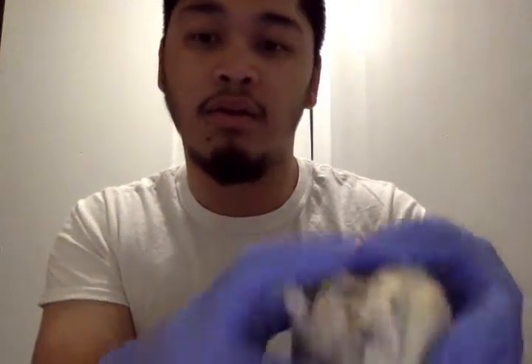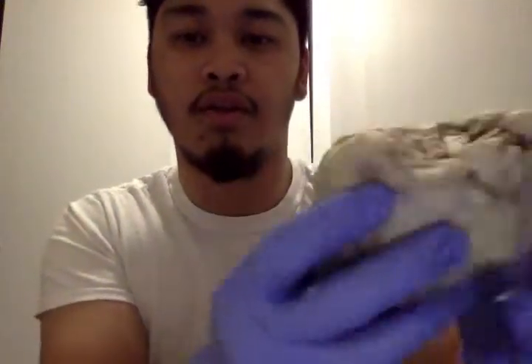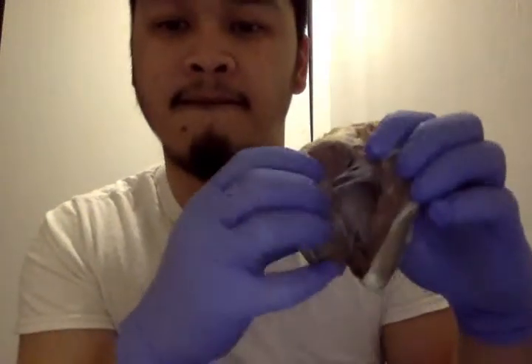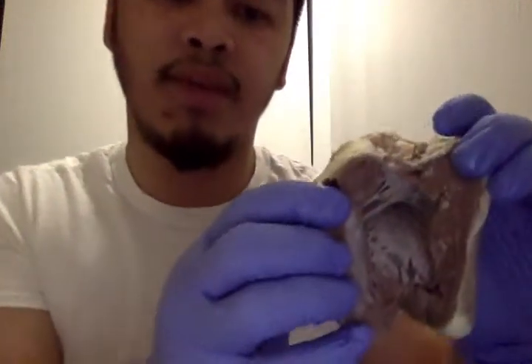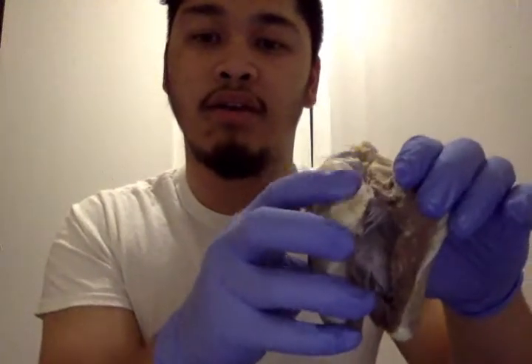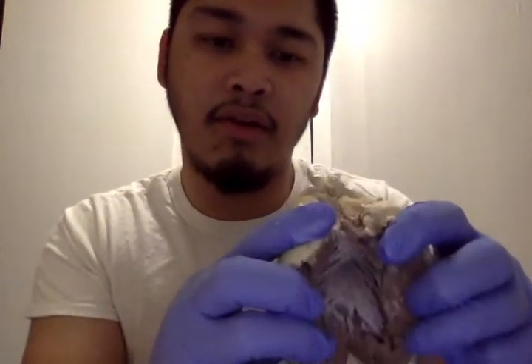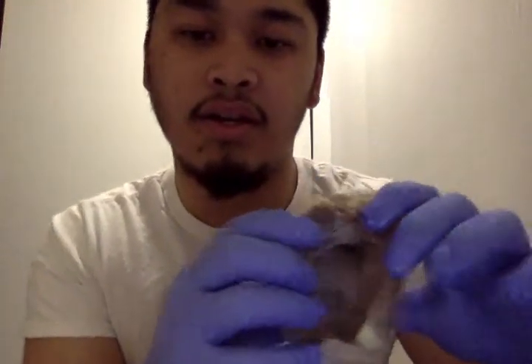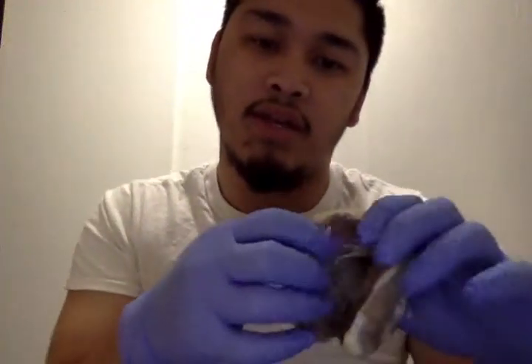The posterior interventricular sulcus is over here. I already opened it — it is very hard to open. You can see the left atrial wall over here and the right over here. The left ventricular wall is over here and it is very thick. You can see it's empty.